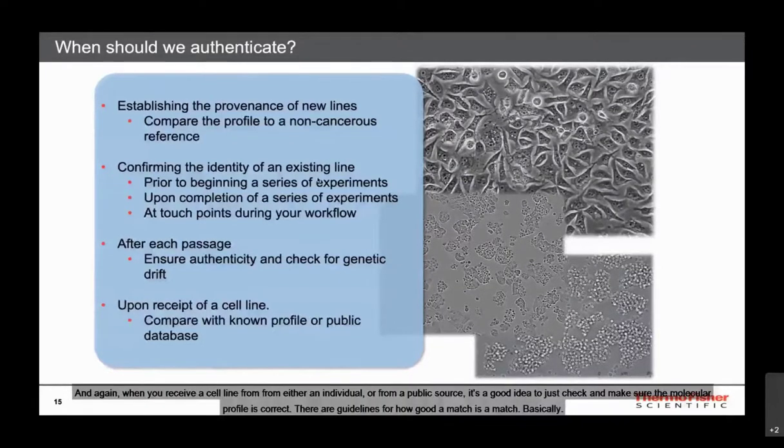And again, when you receive a cell line from either an individual or from a public database, it's a good idea to just run a check and make sure that the molecular profile is correct.